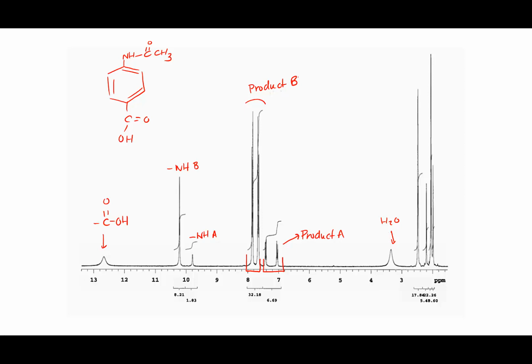Also notice I changed solvent, because the carboxylic acid really doesn't dissolve in deuterochloroform that well. So I'm using deutero DMSO. DMSO has this structure.